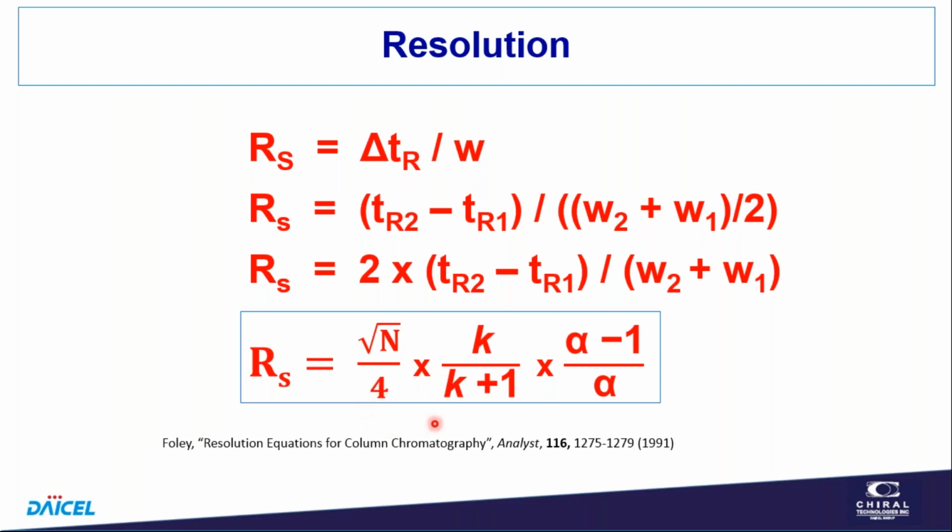There's several forms of the resolution equation. I would refer you to this. Joe Foley has done, I think, a really nice job of discussing that in this publication. Fundamentally, the equations look like this, but based on some of the assumptions or the ways that you want to make measurements, you may get slightly different terms. I'm not going to go into that, but that could be important. But for our purposes, an equation like this is perfectly acceptable.